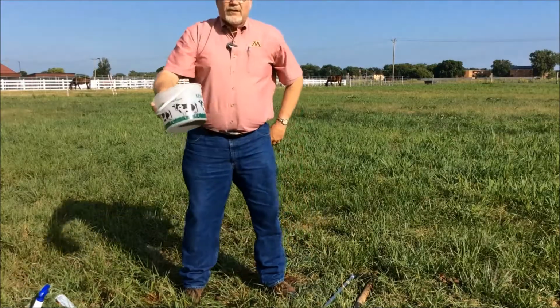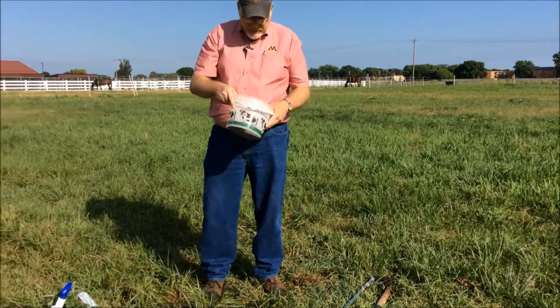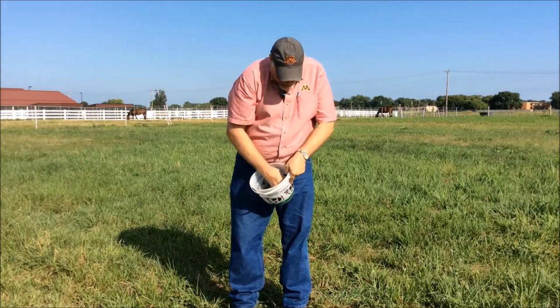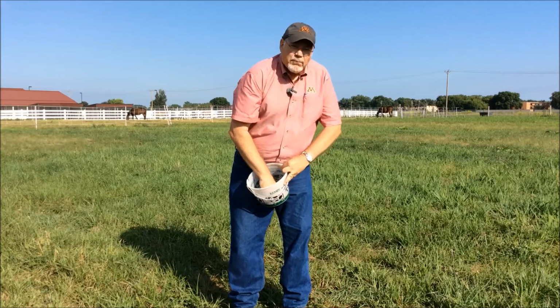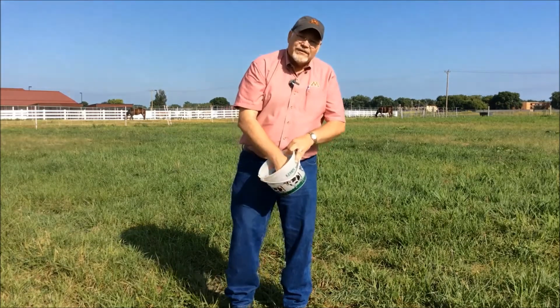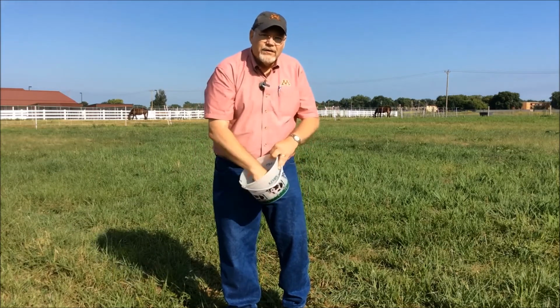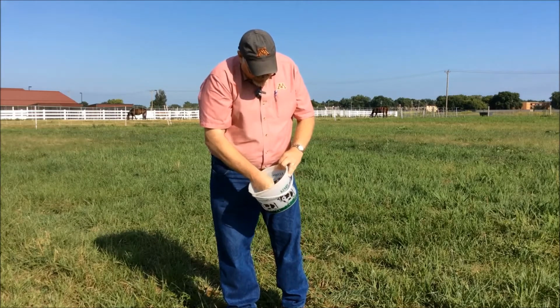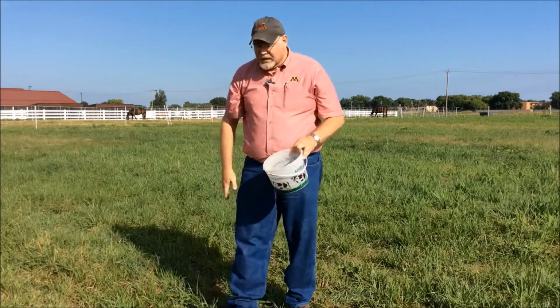Let's say we've gone out, we've got our 20 cores. Got them in the bucket. Then you mix it up really good. If you've got some plants in there, you might want to throw those out of the sample because they'll bias the organic matter analysis. So you get it mixed up real good.